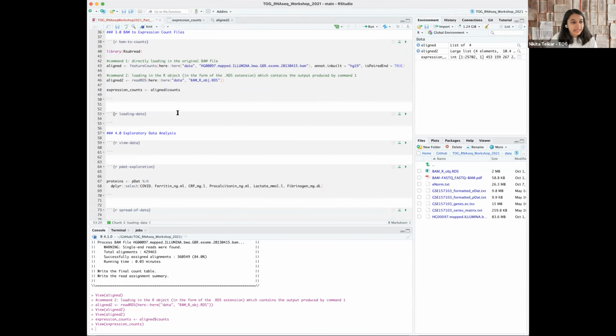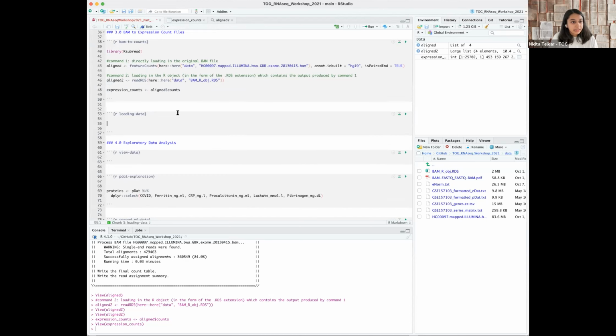Okay, cool. So then let's do this. So now in loading data, we are actually going to use the data that are formatted, and we can start with our analysis. So what I'm going to do is name it edat, so E for expression, dat for data. That's just how I've been taught to do it. And then this command, read.delim, which means it's reading in a delimited file. And then here, specifying the package, and then, like I said before, the data folder.